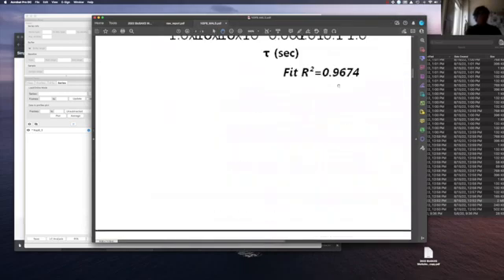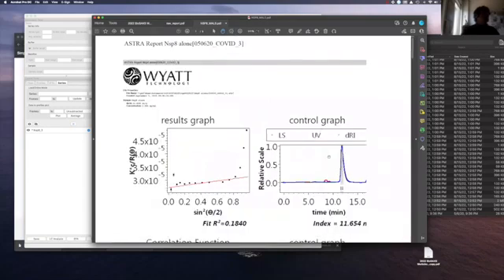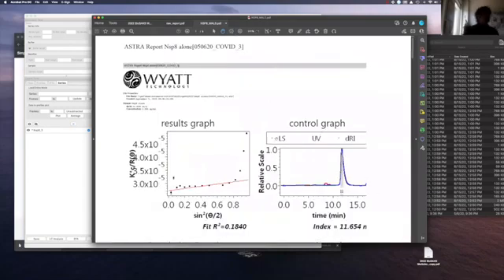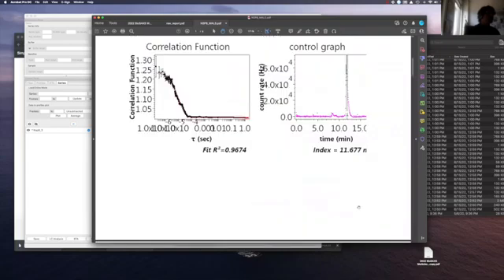And so when we go here, a little bit smaller, these are all the light scattering, UV, and refractive index aligned on each other. So you see you may have a little bit of aggregation. That's the light scattering seen first, obviously, and then the UV, refractive index, and light scattering have one nice peak. And this is the dynamic light scattering signal, so-called QELS.